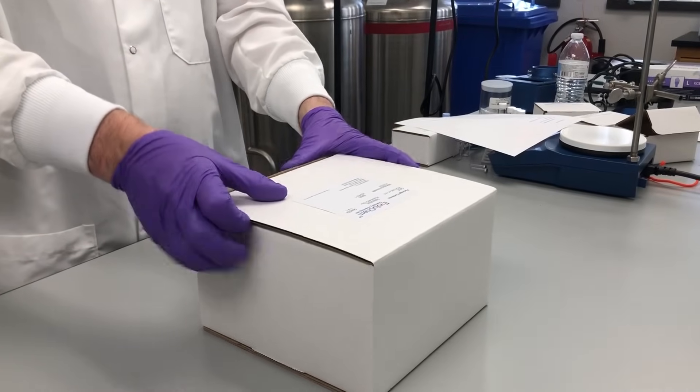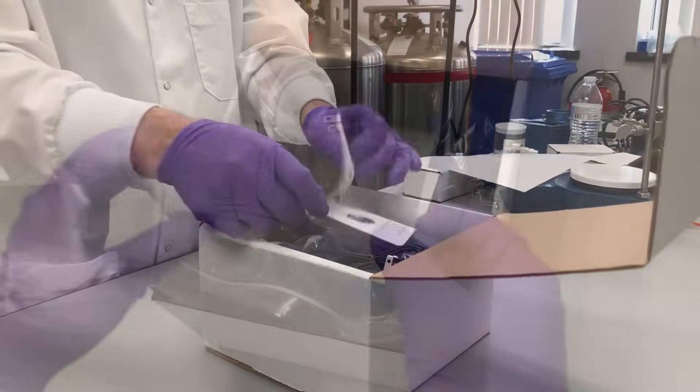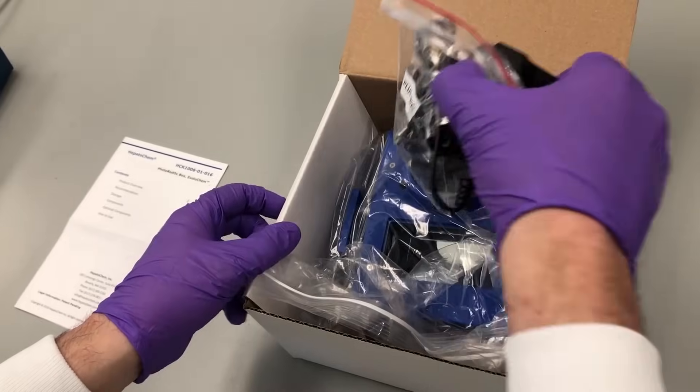Each EvoluChem photoreactor is individually packaged when ordered. The photoredox box comes with a simple operator's manual which includes basic setup and operating instructions as well as contact information.